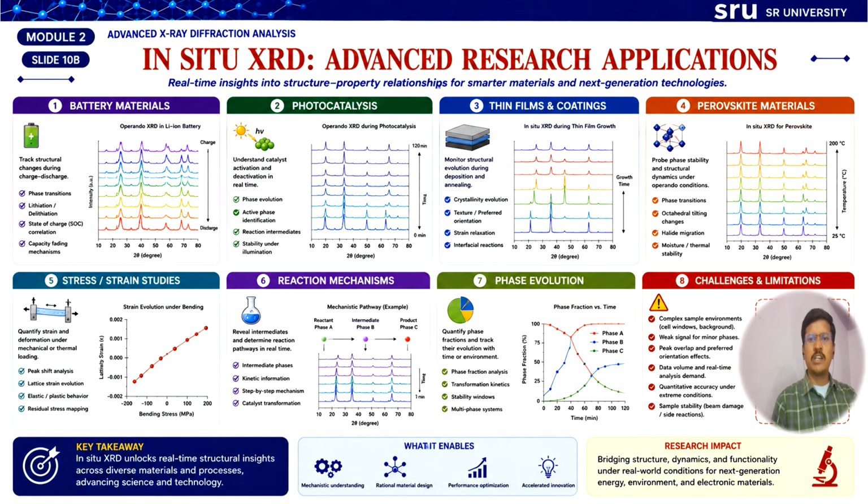During charging and discharging, the battery electrodes undergo continuous structural and phase changes. In situ XRD allows the researchers to monitor phase evolution, lattice expansion, structural degradation, and reaction reversibility in real time. This information is essential for designing high performance and long life energy storage systems.